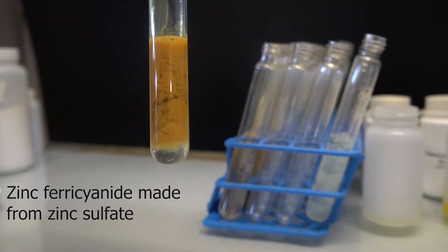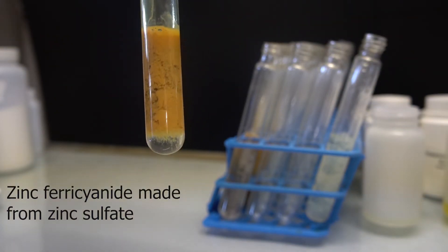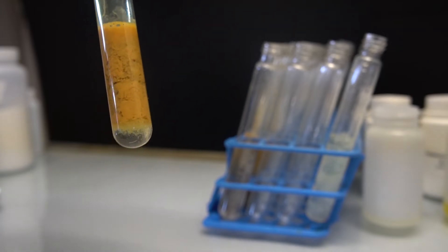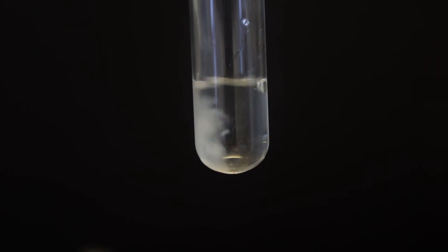Here is the zinc ferricyanide in the test tube. Then, just as a second confirmation, we dissolved zinc powder in hydrochloric acid and repeated the tests. Again, we produced zinc ferrocyanide, which this time was white, and zinc ferricyanide, which again was orange-brown.